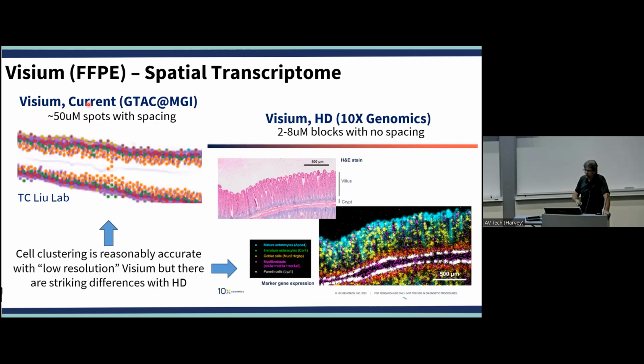And the orange that you see there represents the, sorry, this one's kind of hard to do. Okay, I'll just point to it this way. The orange dots represent the enterocytes. The green dots on that slide represent the progenitor cells. And then underneath that, which you probably can't see too well, the red dots are where your crypts are and where your Paneth cells are. And then below that, you start getting into fibroblasts and plasma cells.